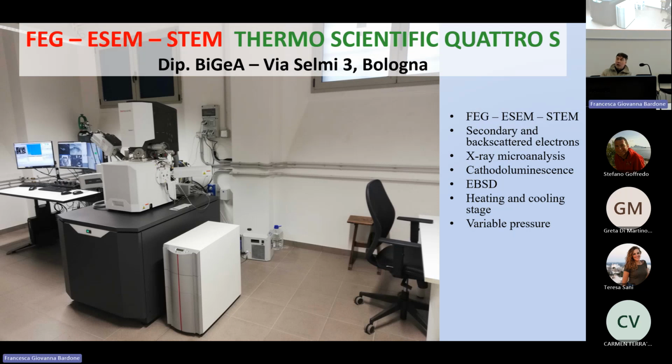If you coat with carbon, you need to create a thin layer of amorphous carbon on the top, and this layer is conductive, but can prevent the observation of tiny details if you need nanometer scale resolution. So in classical SEM, you must cover the sample. In the environmental one, as I will show, you don't need to cover. So you have two advantages.